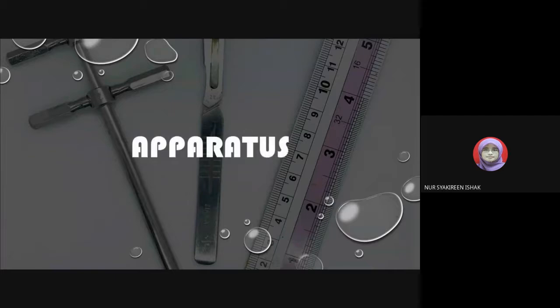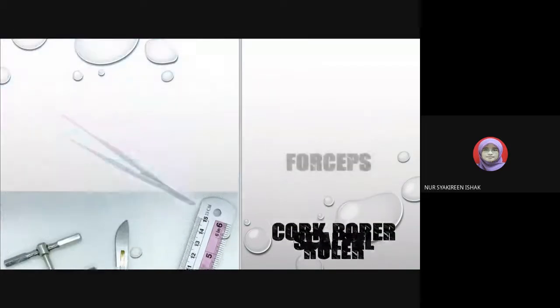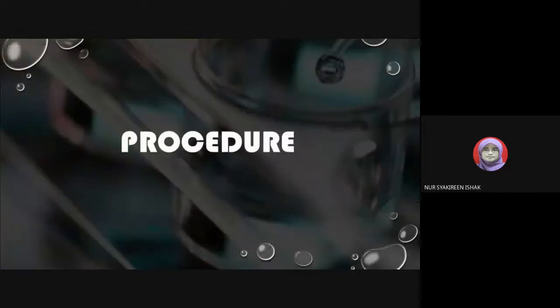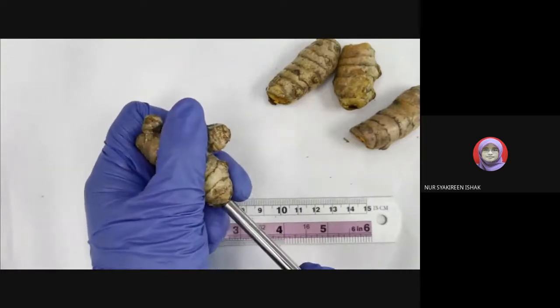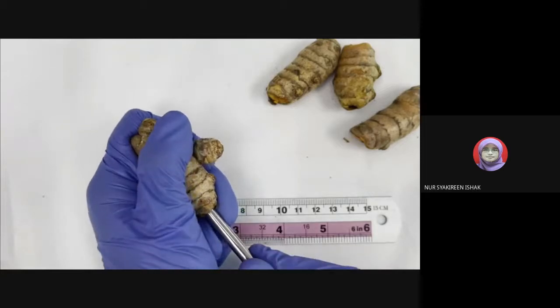Now, let's take a look at the apparatus needed. We need cork borer, scalpel, ruler, forceps, beaker, and measuring cylinder, not to forget a white tile. Use a cork borer to cut 6 cylinders of fresh Curcuma longa tissue.